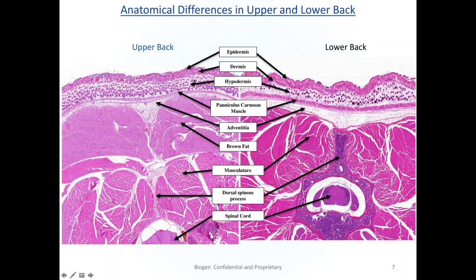So we were using these maps because, as we went into our ultrasound images, we really were trying to interpret and understand what the ultrasound images meant in terms of which layers of skin, or what tissue layers, we were looking at. Okay, so that's the background.